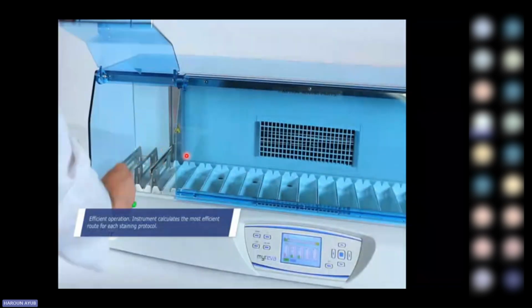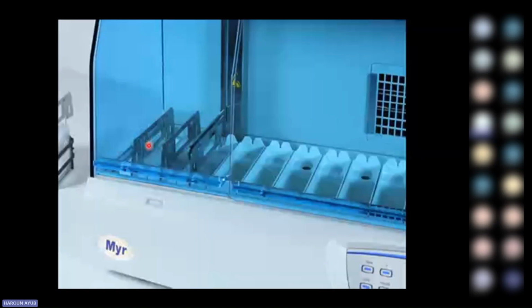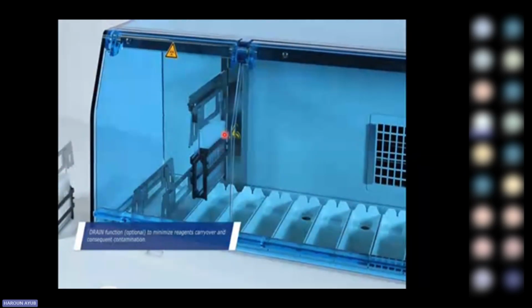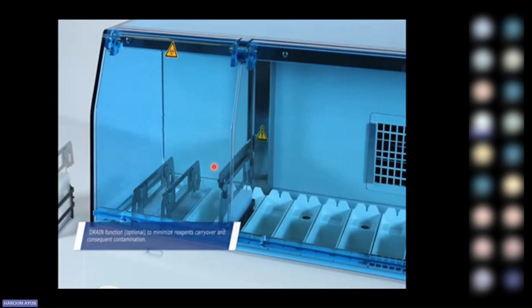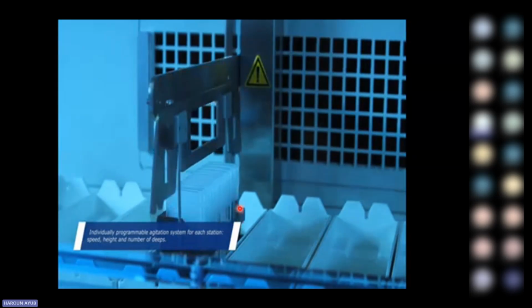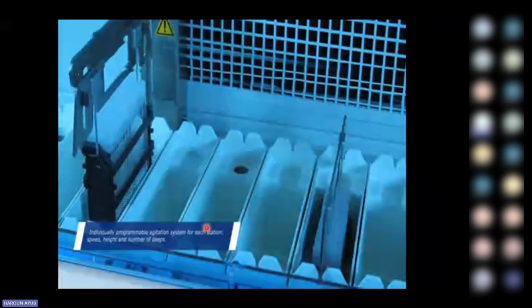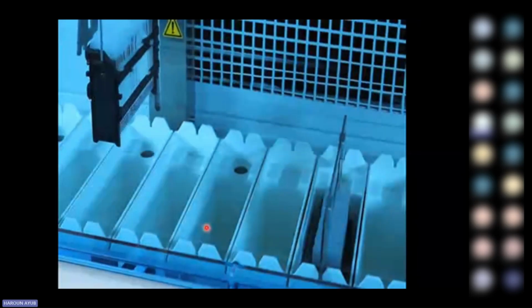So as it has moved the other processes, it will still come back and pick and remember which process is for which one. So after lifting up, it allows shaking. So this one ensures the way we do the step manually. So for very busy labs, it's very important if you just have an automated unit to help you in that particular process, and this reduces the workload on the histotechnologist, and you can process more samples as this process is going.